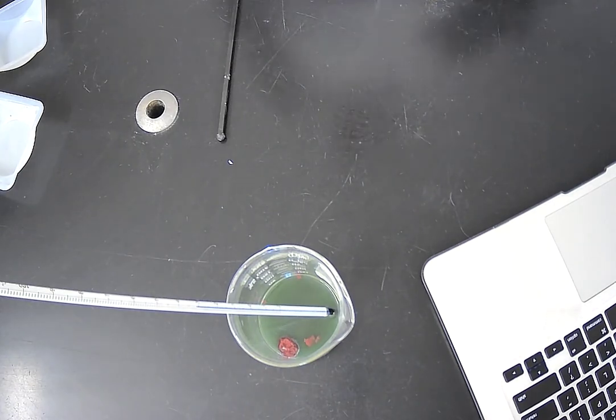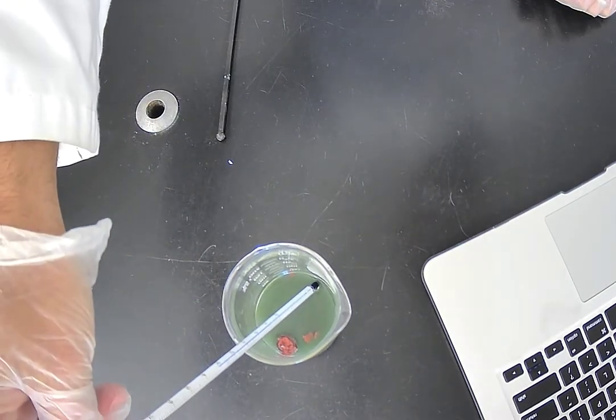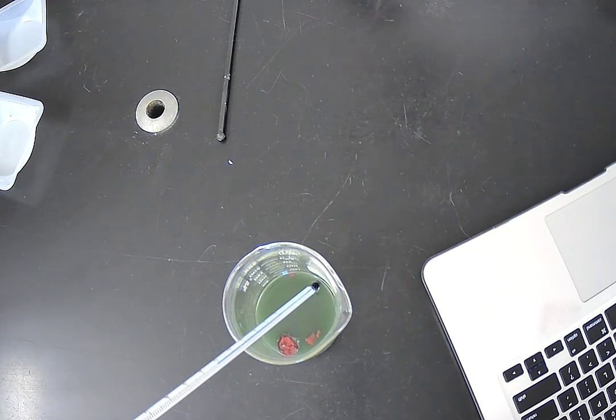Okay, I'm a little past 4 minutes here. And now I'm up to 31 Celsius. We'll do it for 1 more minute.